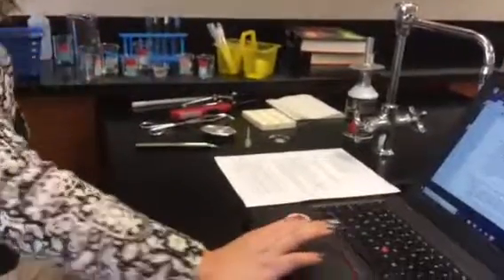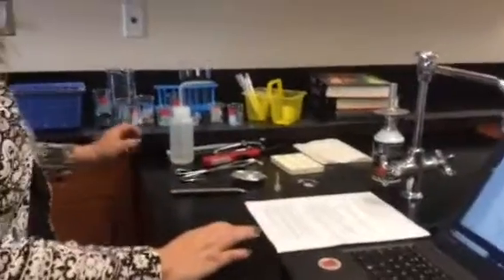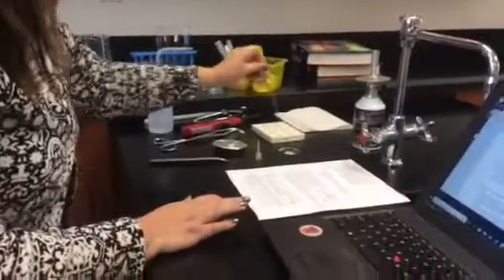So the other one is going up here, and now you're putting one down here. All right, and then it says mix it with water, and here's your water. Be smart about the way you do this, because if you push too hard, it's going to take it all out of the plate, and you don't want that. And then use the stirring rod. We're going to stir it up together. Stir, stir, stir.